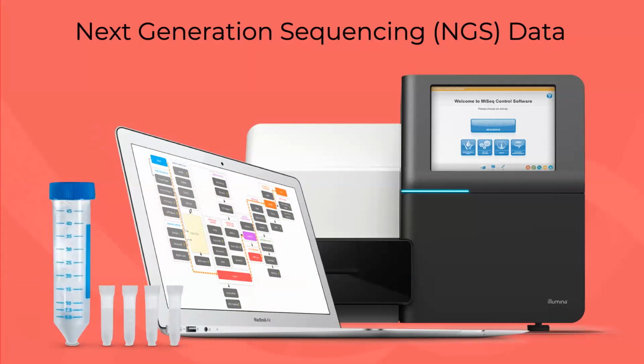viruses, but for any kind of sample really, what happens is you have a biological sample, and then that biological sample contains DNA or RNA, and that DNA and RNA has to be converted into digital data, which then has to be analyzed. And so today we'll talk a little bit more about that process of extracting a sample and eventually turning it into this digital sequencing data.